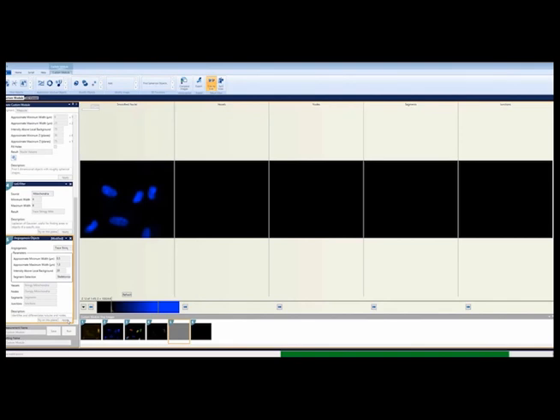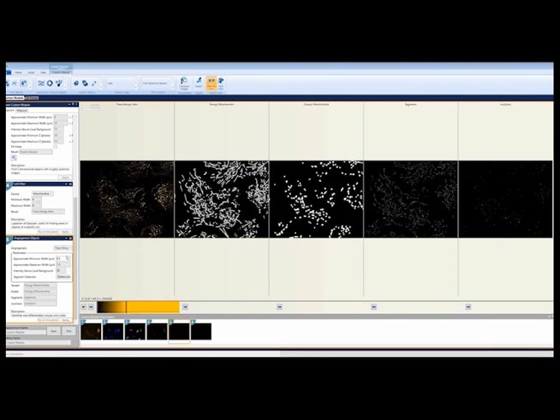Angiogenesis produces 2-dimensional masks. Our module requires volumes, so we need to connect the 2D masks into 3D volume maps. There are 3 connection rules to help with this. Do not connect objects generates a 3D volume map without actually connecting objects. Good for when the objects are smaller than the Z step, but you still want to accumulate results in 3D.